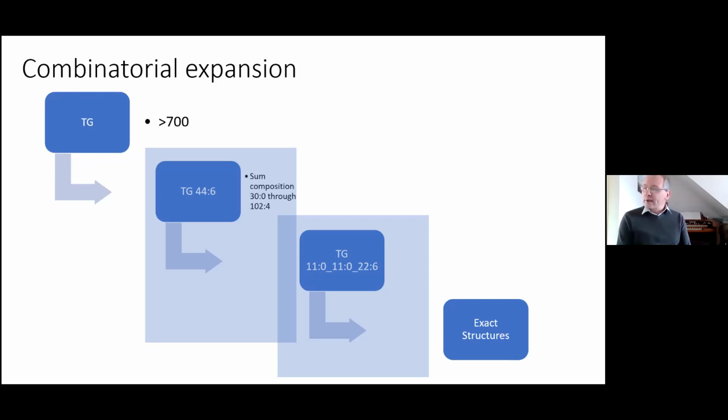And combinatorially, of course, you can have those in any of the positions. You'll note the underscores in that name, indicating, as I said on Monday, that the position of the acyl chains is not defined. But then you can drill down further to specify where the acyl chains are and where the double bonds are to get the exact structures for that.